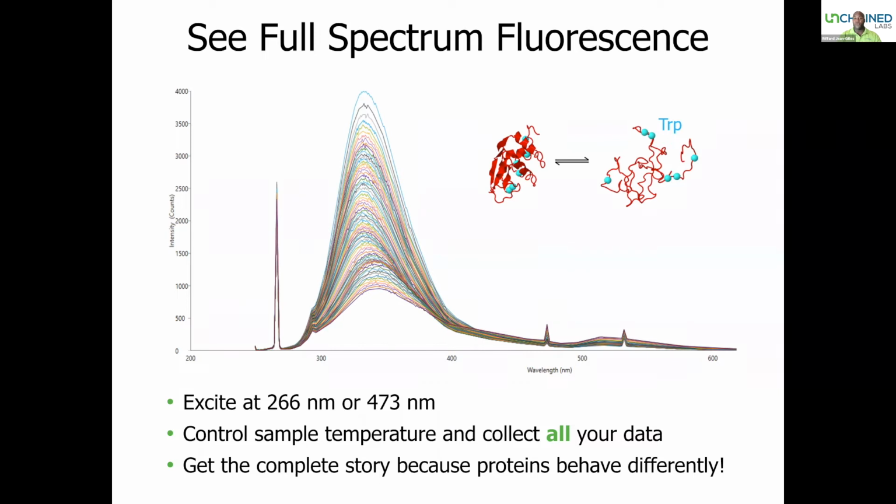The raw data for this experiment is a full spectrum, as we stated, from 250 to 720 nanometer. What you typically expect to see is that as your protein unfolds, you're going to have a spectrum here, which is characteristic of the relative unfolding of your protein as the microenvironment around the tryptophan or the aromatic amino acids begin to change. And as they do so, you'll begin to see that the spectrum itself may change in a number of ways, and you don't have to know exactly how it works. The software will take care of it completely.